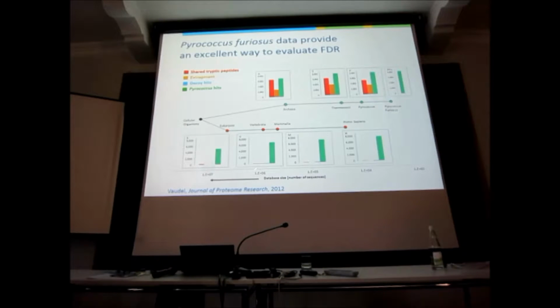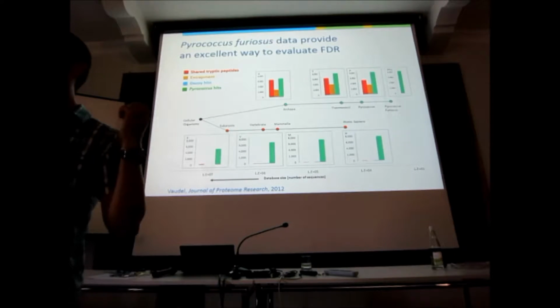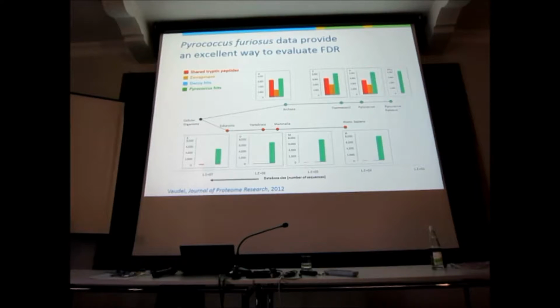And you see what happens? We control this FDR beautifully. Right? So when the algorithms claim that your FDR is 1%, it really is 1%. So who can spot the problem here? What is the problem? There's a very, very big, shining, glaring problem screaming at you.